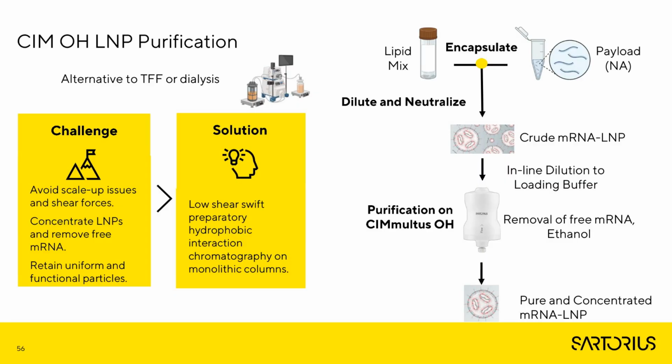Here, especially, we're talking about the OH column that I described in the 2D analytical setup. This column, we have now come to a stage where we can robustly use it to capture the particles and release the particles from this column, and for it to be an alternative to TFF or dialysis. Dialysis is used at small scales and TFF is used at large scales. Here you can use the same process for all scales. So you can use the same process at a lab scale at the screening stage, and then you can use the same purification process when you scale up to a very large scale.